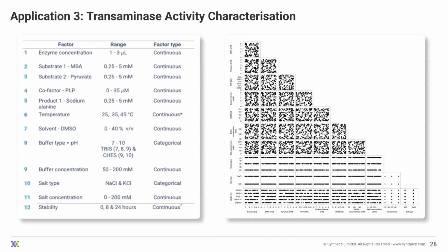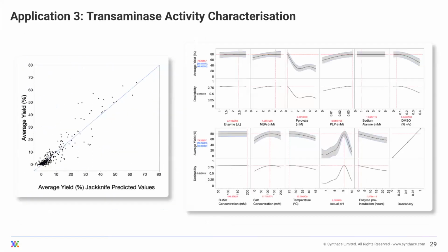So we're looking at an 11-dimensional space here in 2D. Each one of the black dots is another experiment that you are setting up. And you can see that these are such complex designs. They're not the sort of design that you would likely set up manually in the lab. But with automation, they can be extremely powerful designs. You can learn a lot in a single iteration.